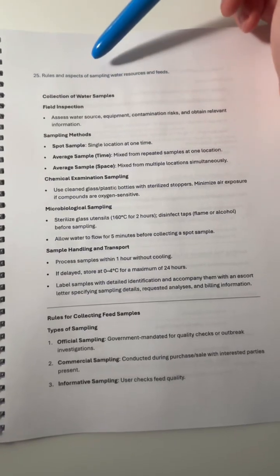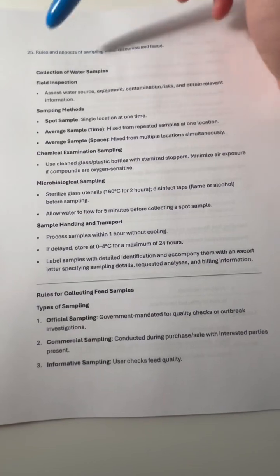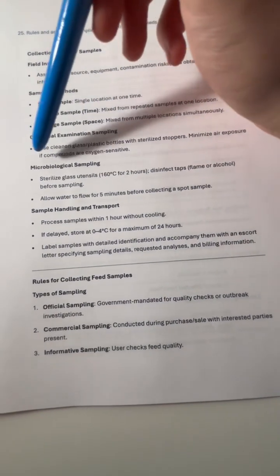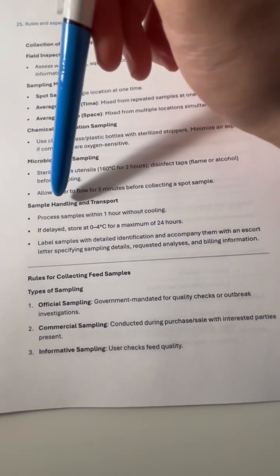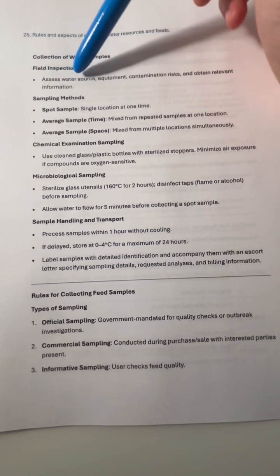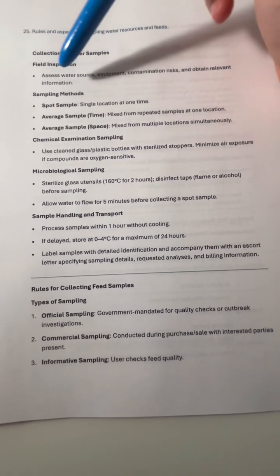Rules and aspects of sampling water resources and feeds. So for collection of water samples, you have the field inspection, sampling methods, chemical examination sampling, microbiological sampling, and sample handling and transport. For field inspection, you assess water sources with equipment and contamination risks and obtain relevant information.